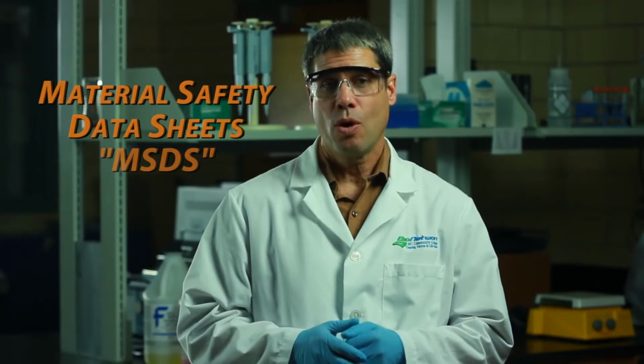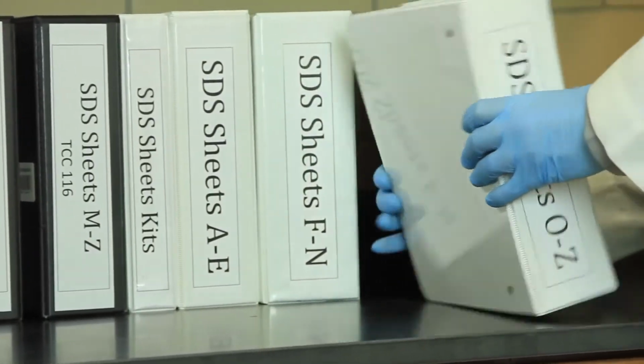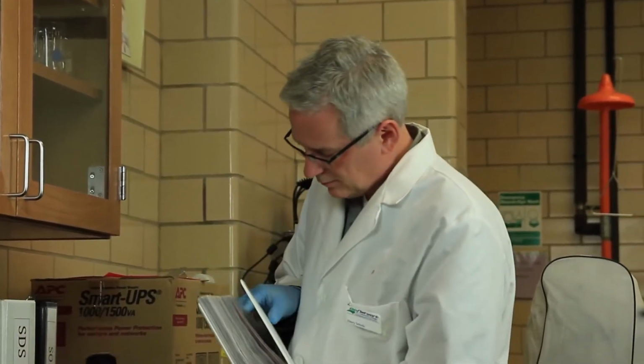These were formerly known as material safety data sheets, or MSDS. The safety data sheet is a one-stop shop to find out about a chemical's properties, hazards, and safety precautions. Know the location of the safety data sheets in your lab and review them before working with a chemical for the first time.